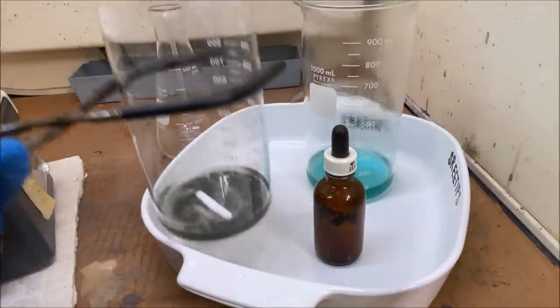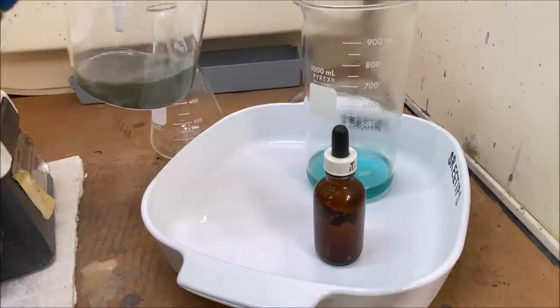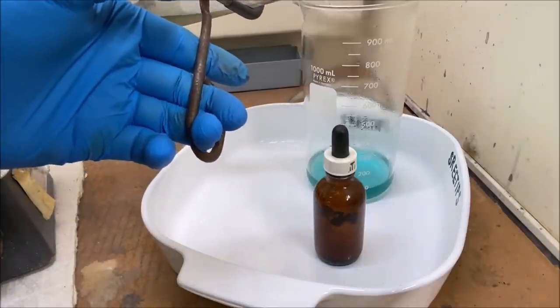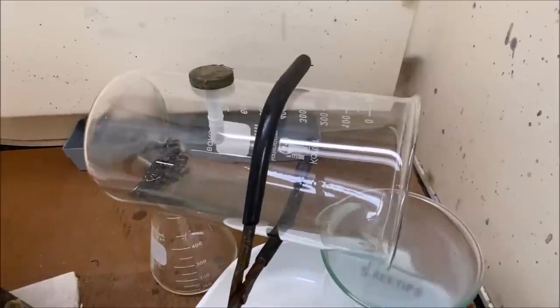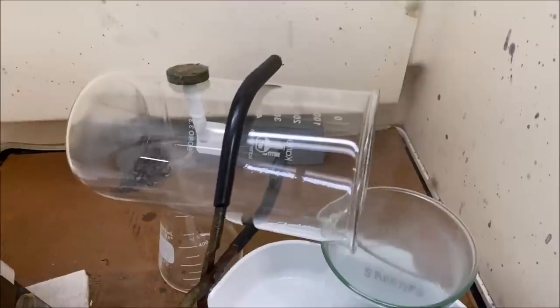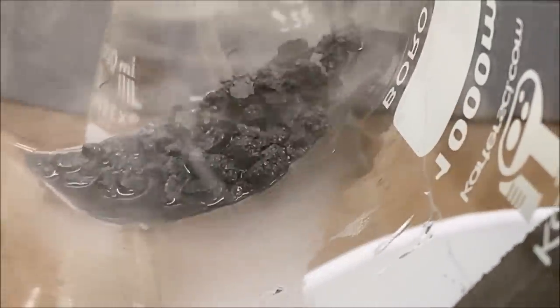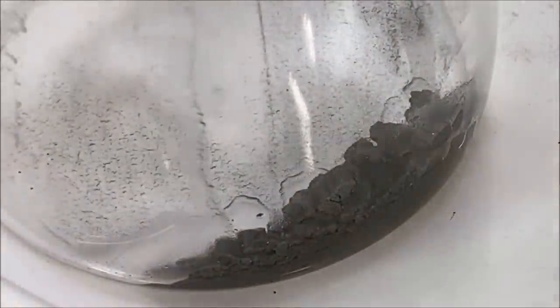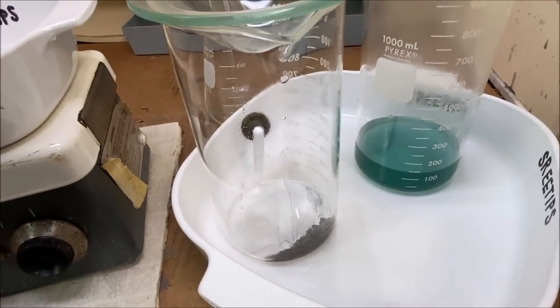Pour this nitric boil off. Come here, you. And that stuff's looking pretty clean in there. Looking at being ready to put some aqua regia on this. Here's our gray material, and I think what we're gonna do now, let's go ahead and try this.